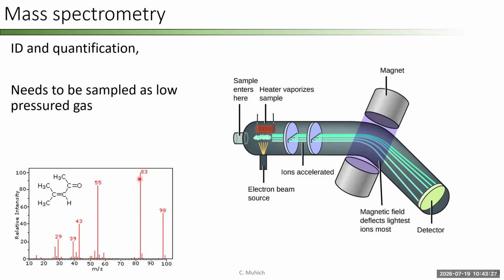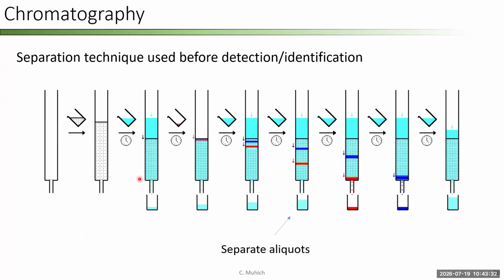All right, that's all of the spectrometry I wanted to talk to you about today. I want to briefly remind you about chromatography, because this is widely used in analytical techniques. Remember, we had previously used chromatography for separation. We're going to rely on that again.